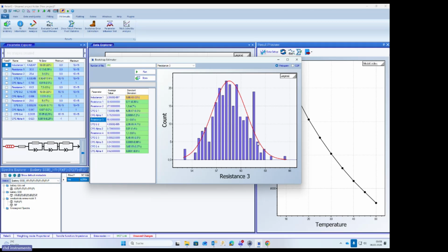You might have situations, and this is really not so rare, that you might have 2 maxima. And this is the case if there are maybe 2 different models or 2 different ways for fitting your data. And this is quite interesting here if you can just visualize this. This is quite a nice feature.